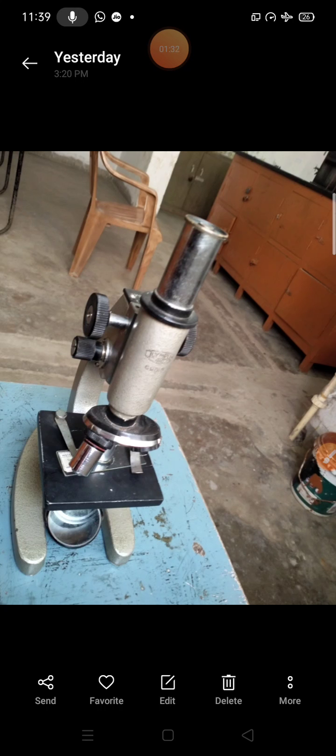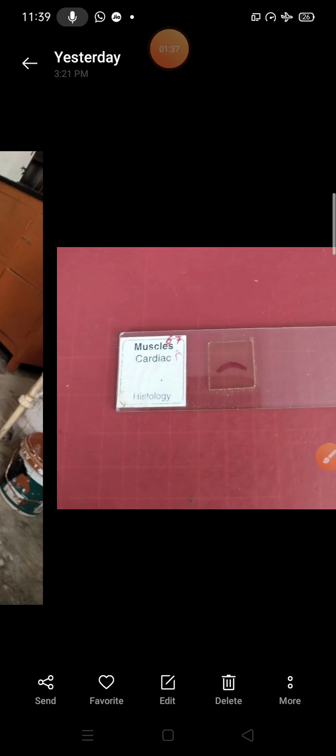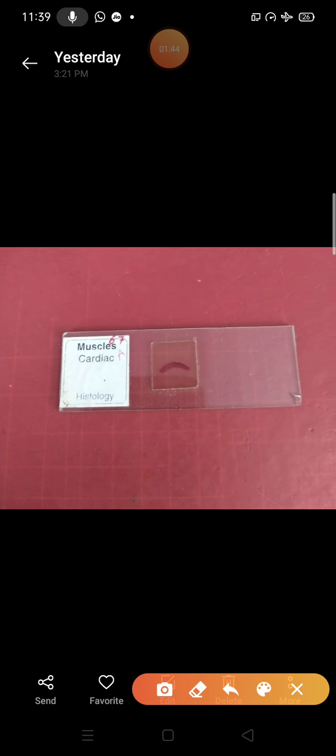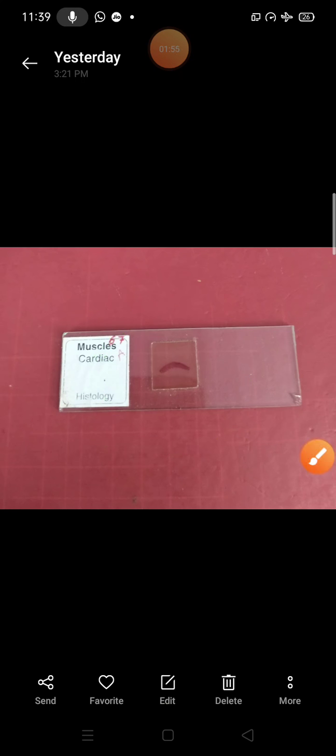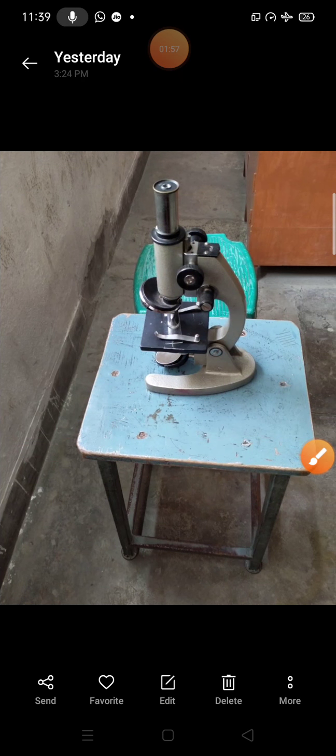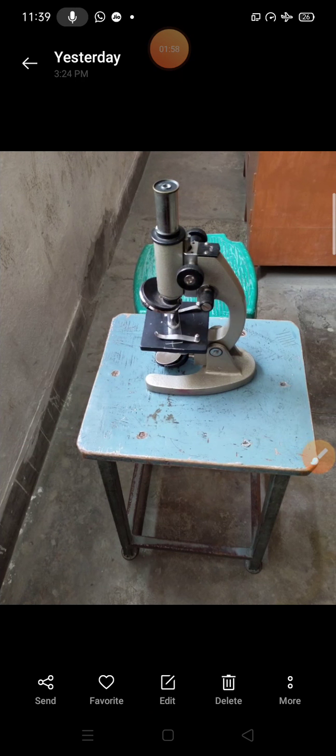You can see here, this is the compound microscope. And this picture shows the permanent slide. You can see the specimen in this place which is fixed under the microscope.